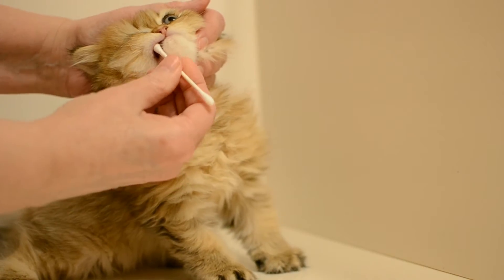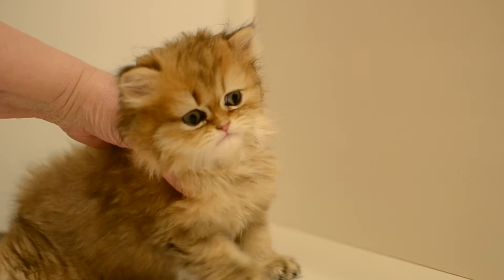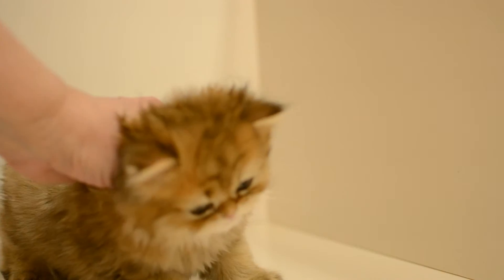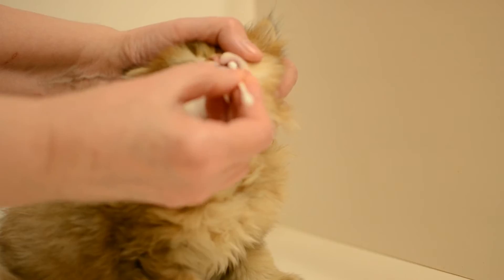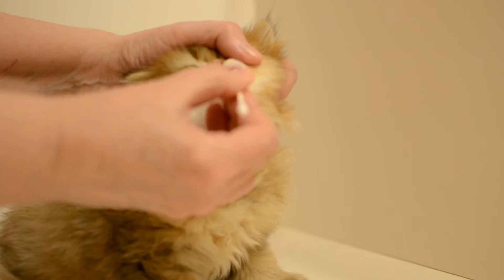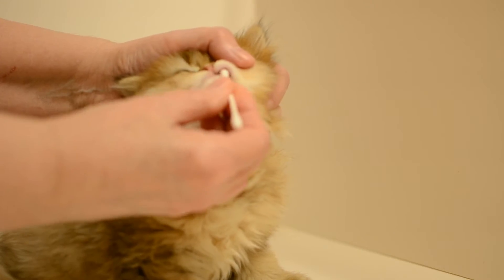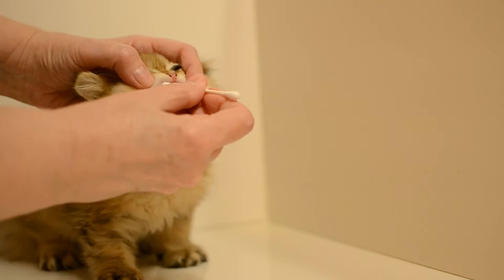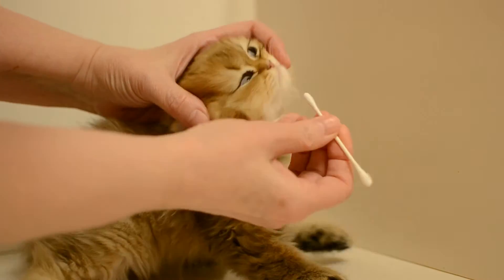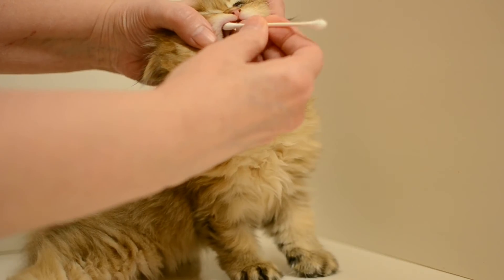There's two, and we get another fresh Q-tip and we do it two more times. Good boy. What you're doing is you are scraping skin cells from the inside of the cheek, so it's not about getting saliva — it's about getting cells.